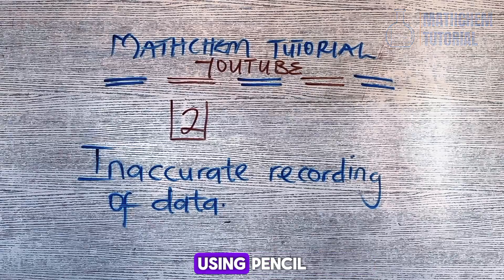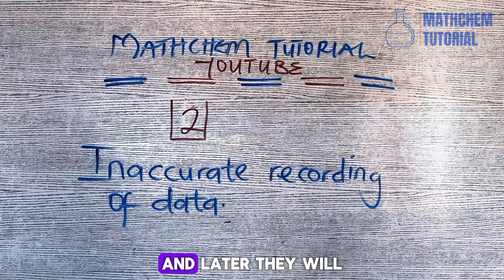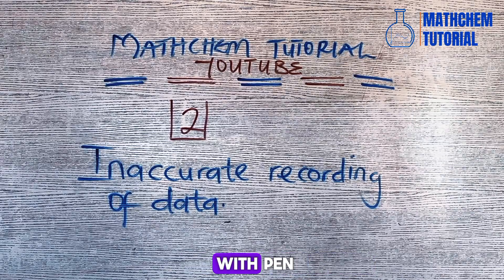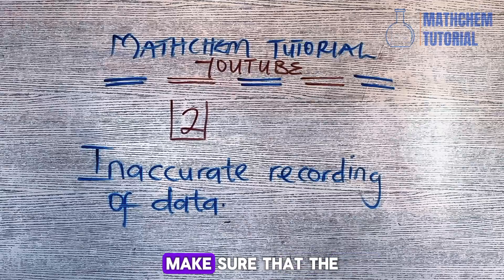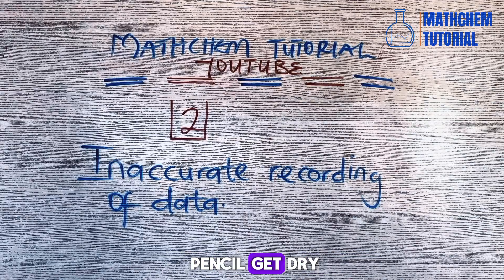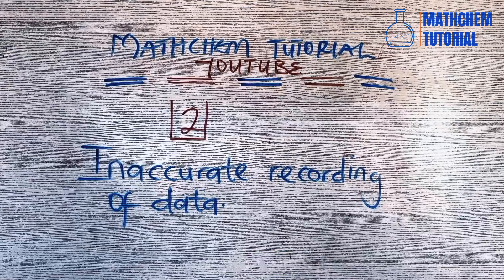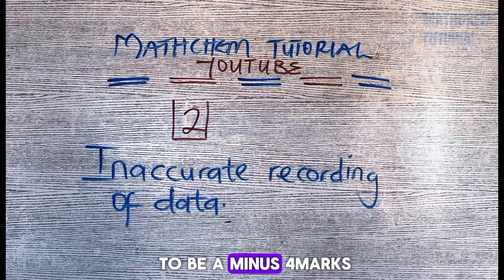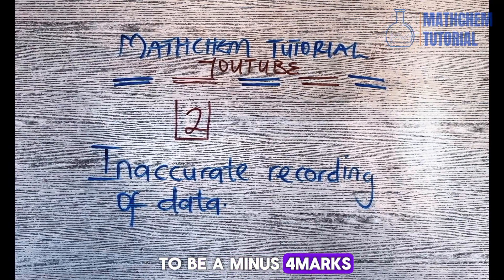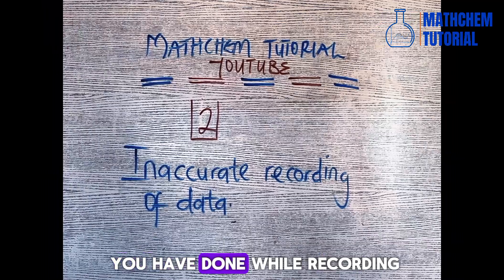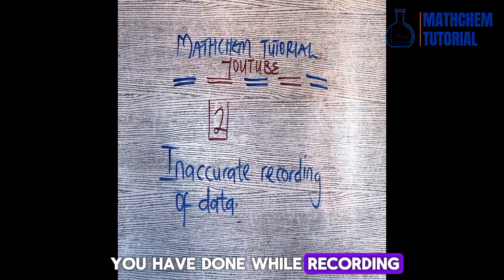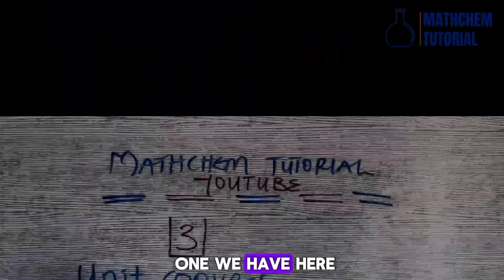Also, don't trace over pencil with pen. Some students will record their data after titration using pencil and later trace it with pen — avoid that. Make sure the pencil is fully erased and your recording of data is clean and perfect. Using pencil to record your data will result in a minus four marks deduction from your titration score.